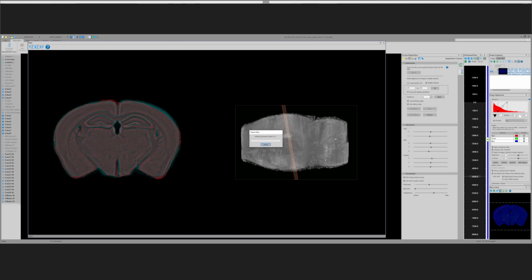A major limiting factor in all of this has to do with the imaging time. The imaging time really is what's rate limiting, and that's another webinar that we'll go through and describe. On average, we have 2 microscopes that we run pretty much all the time, and myself and Ron Piletsky, who works with me, the 2 of us can process about 4 to 5 brains a week, doing a lot of other things at the same time, because a lot of that's just the computing time.